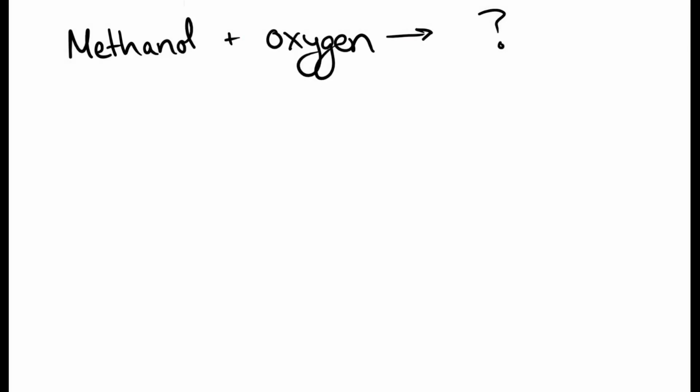Whoa! Did you see that? I don't know about you, but I thought that was pretty cool. That's called a whoosh jug experiment. Now, just to get a better look at it, let's try that again, but in slow motion.